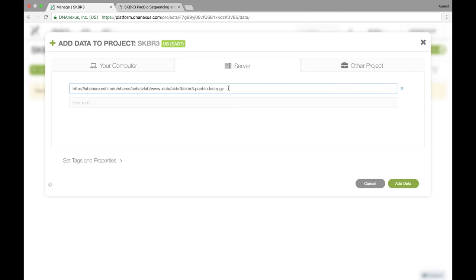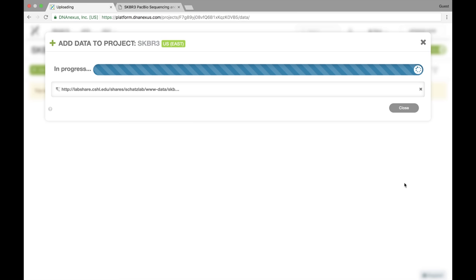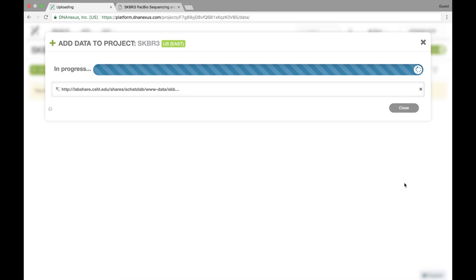So we come back here, I'm going to paste that URL in here, and then click on add data. And when I do that, it'll start uploading the data onto the DNA Nexus platform into this project.